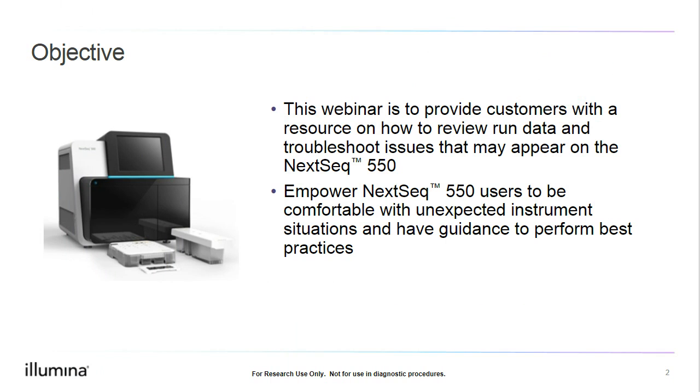This webinar is designed to provide customers with a resource on how to review run data and troubleshoot issues that may appear on the NextSeq 550. We also hope this will empower NextSeq 550 users to be comfortable with unexpected instrument situations and to perform best practices.